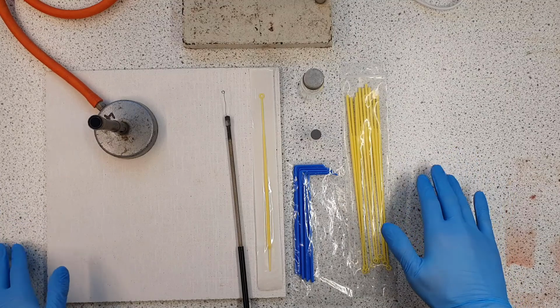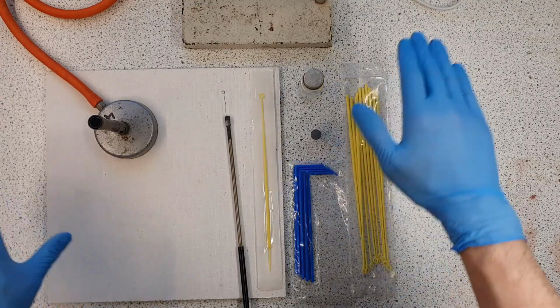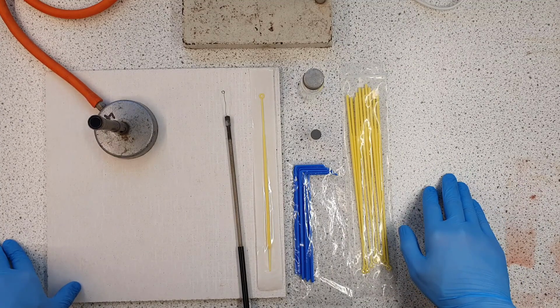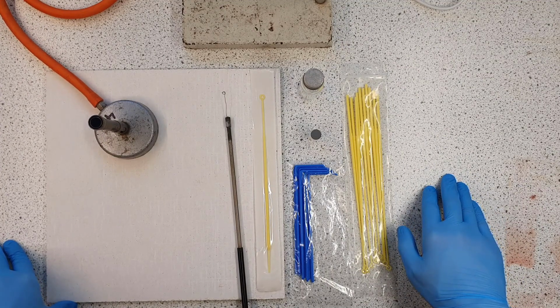I have decontaminated, I have disinfected this entire work surface with an industrial disinfectant. So that's been properly decontaminated.